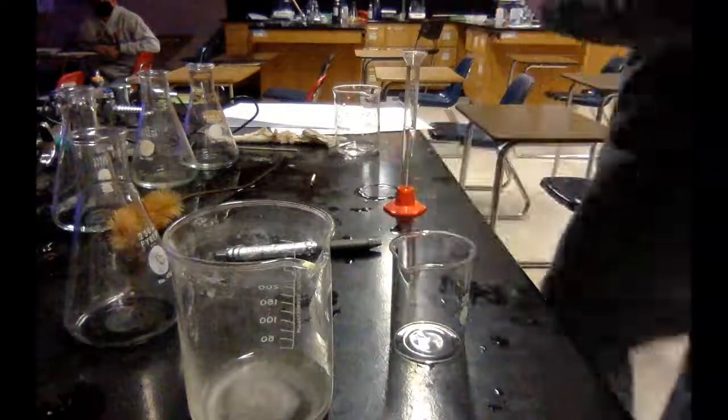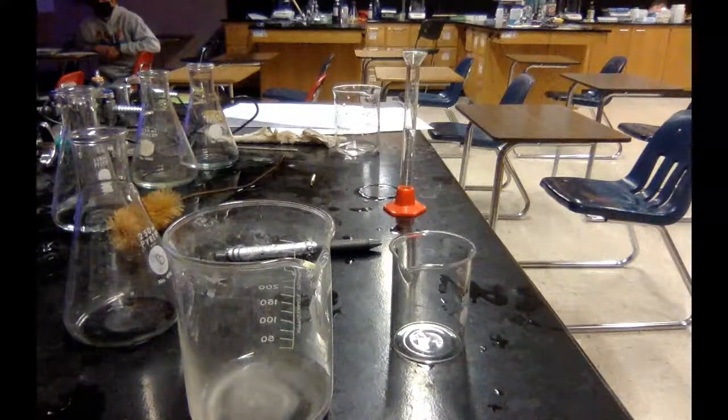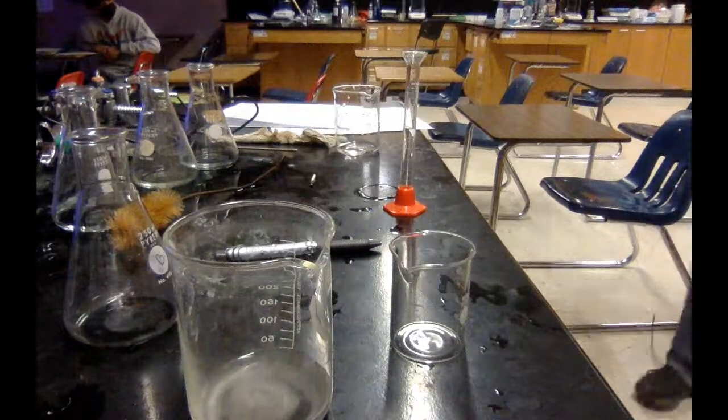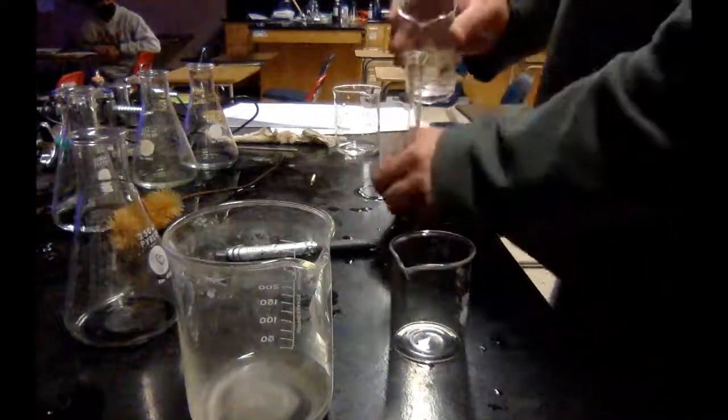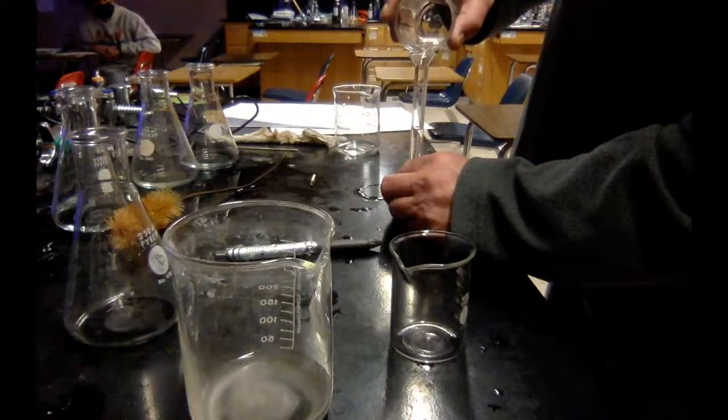Remember, you'll bring yours over here to get the HCl. These never go to your table. Only your beakers go to your table, right? So your hands don't fall off, and so that you don't leave it over here and everybody's like, where's the HCl?